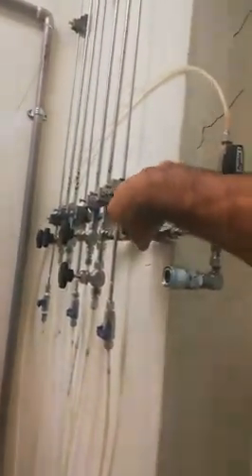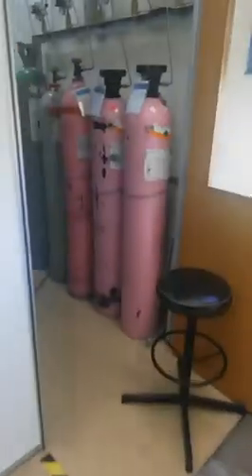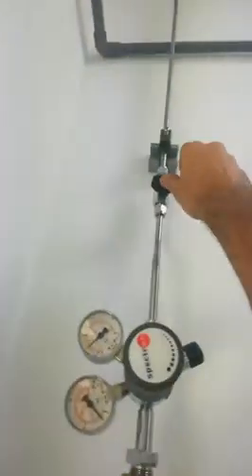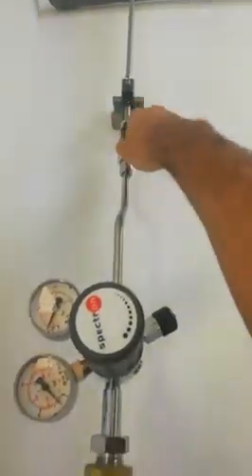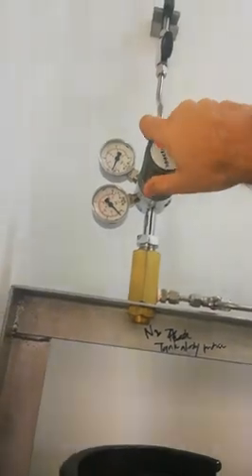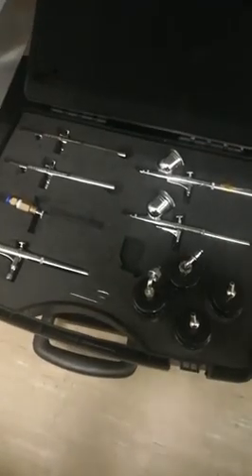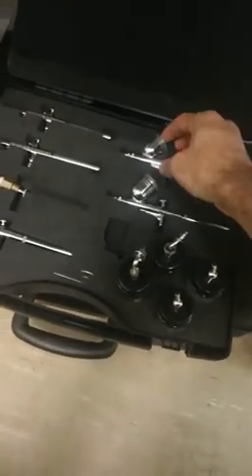First we have to turn on the nitrogen setup. Here we have different shapes available.